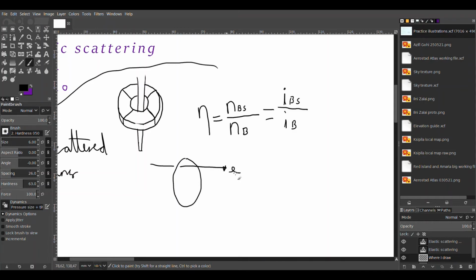So like a number of electrons go through, and you look over a certain time at how many electrons, or more correctly how much charged particle, has passed through an area. So that's more like what a current is. Then, assuming you have counted over the same time for both currents, it makes sense to equate them, since this is over a defined area.